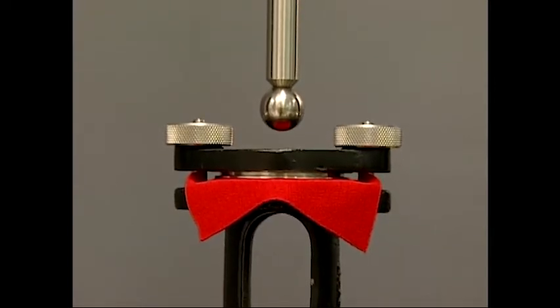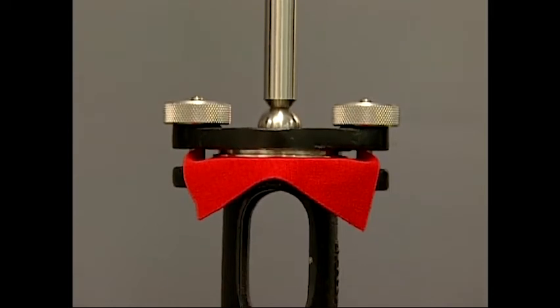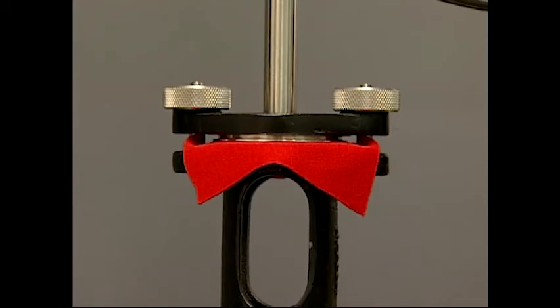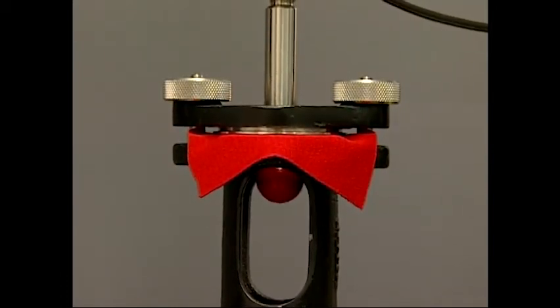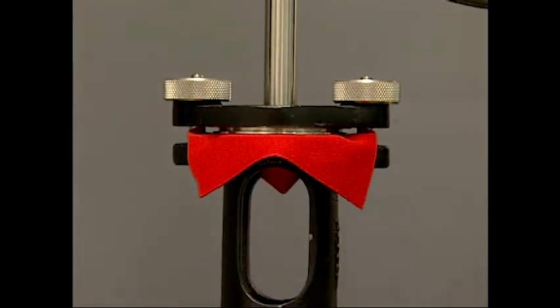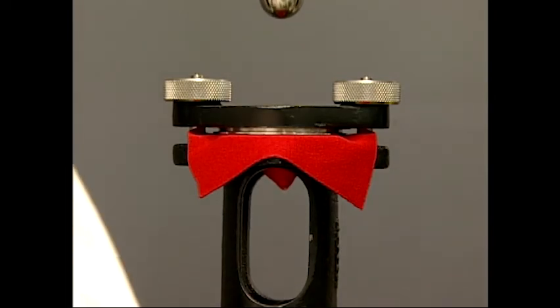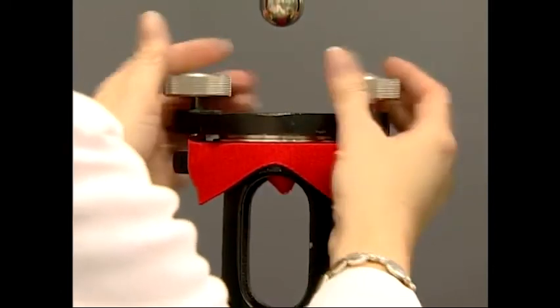The major difference between the two methods is how the force is applied to the specimen. With the inflated diaphragm test, the sphere continues to increase in size as the test proceeds. In ball burst testing, the sphere does not increase in size as the test proceeds. The rounded surface applies pressure to the fabric over an area the size of the sphere. As a result of the differences in the application of the force, the values cannot be compared between the two tests. In fact, each will require its own standard specifications for pass-fail on any knitted fabric.